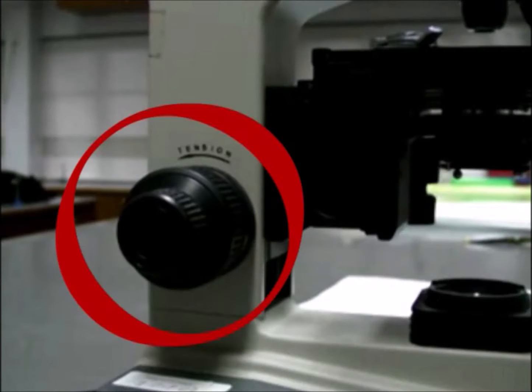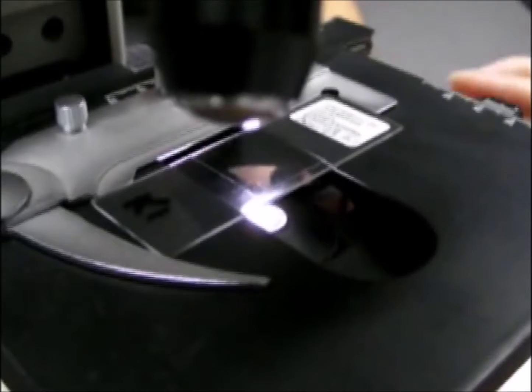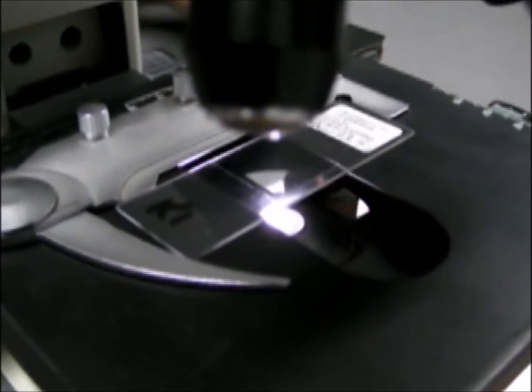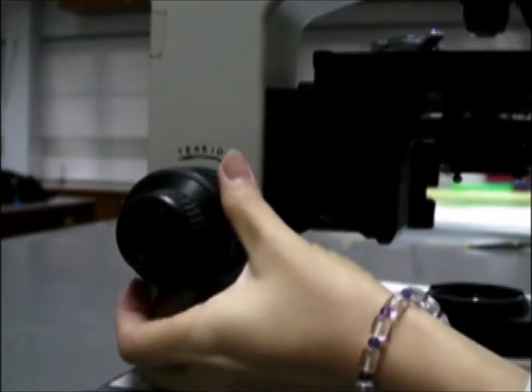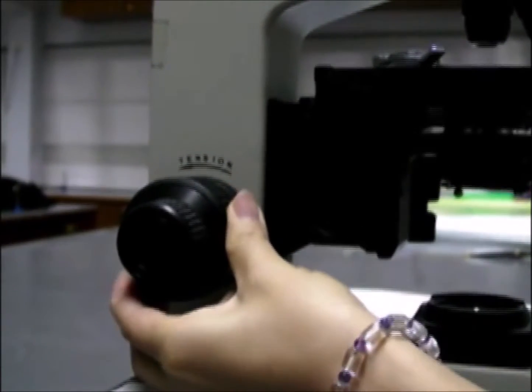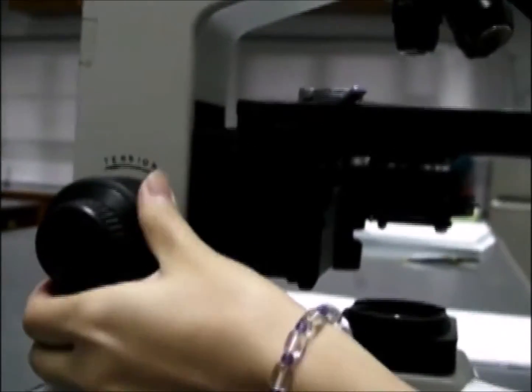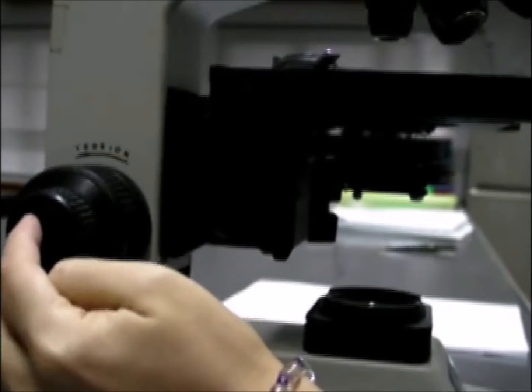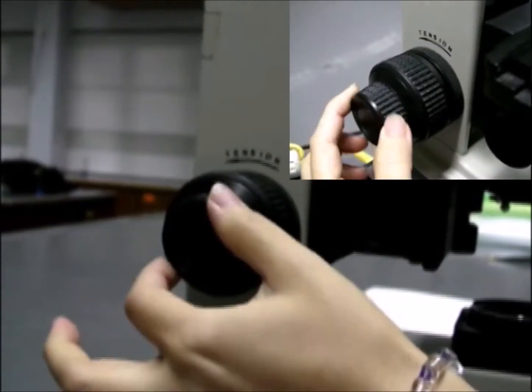These two knobs are used to focus the specimen on the glass slide which is placed on the microscope stage, so that we can see the specimen sharply. The coarse focusing knob moves the microscope stage up and down rapidly, while the fine focusing knob moves the stage up and down slowly.